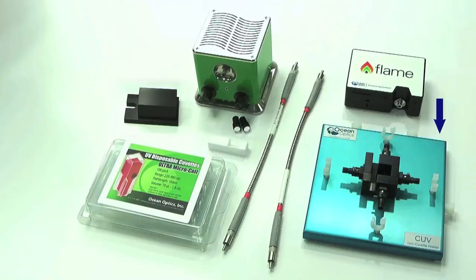The CUV cuvette holder with four collimators and a cuvette cover to prevent external light from getting in, a pack of 8 UV plastic cuvettes for use in the wavelength range of 220 to 900 nanometers.